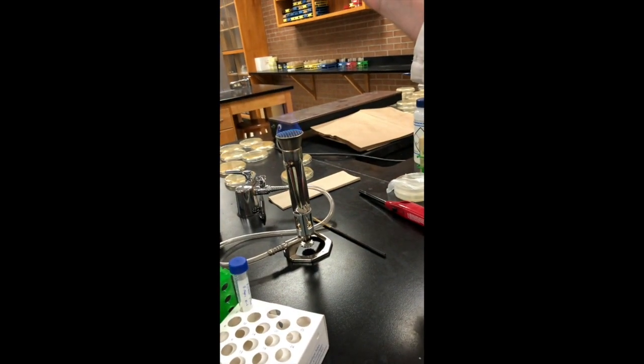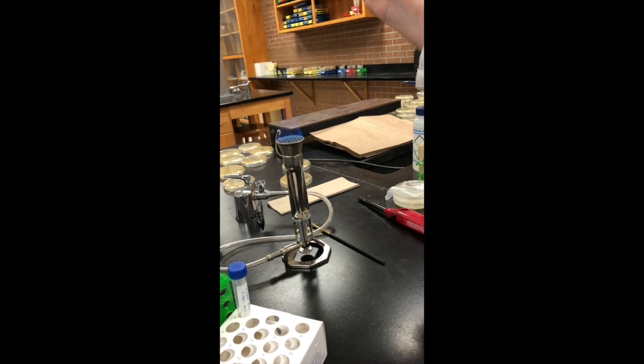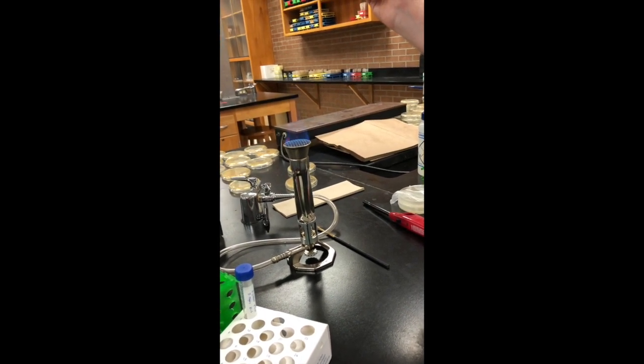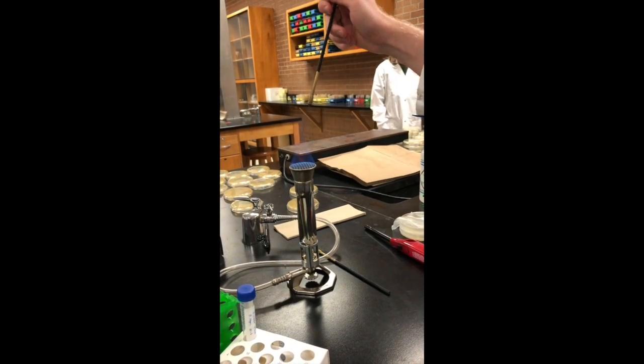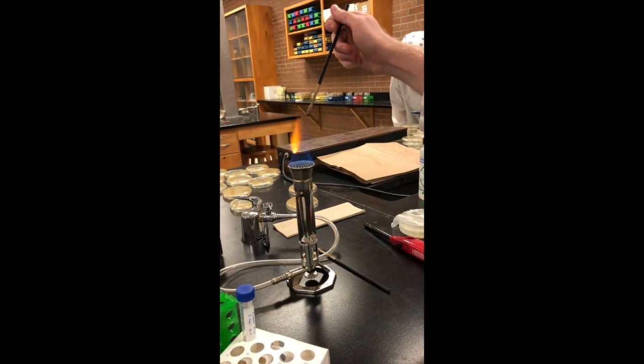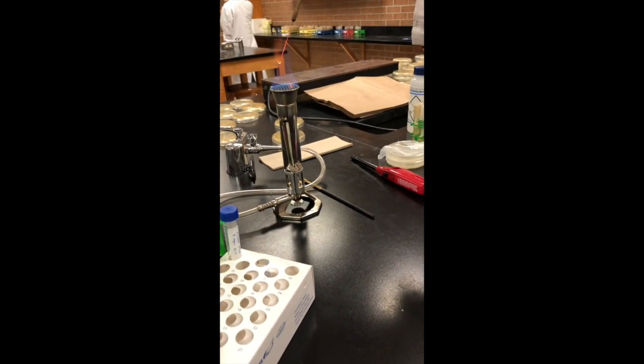No water drop needed. And then, of course, we're going to flame our loop, comfy cozy like. You have to be careful. No aerosols. And so, holding our loop up for 10 minutes. Actually, it's seconds, but sometimes it feels like minutes. And then coming down into our flame carefully.